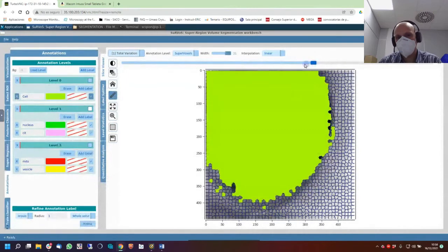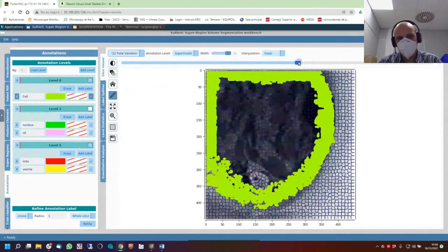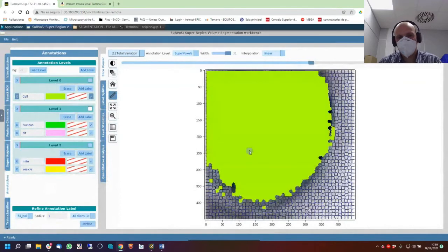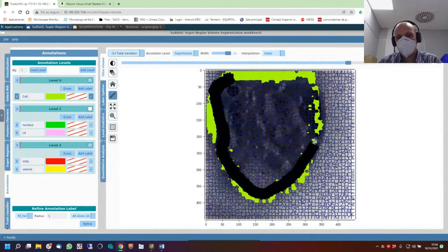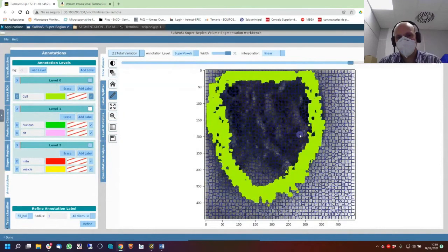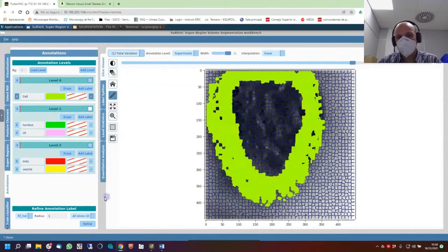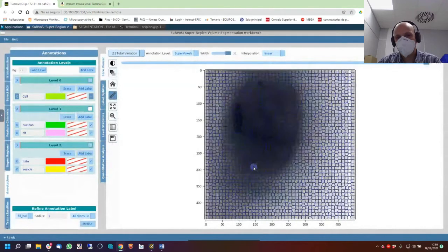Hey, there is some here. Why is it open in some way? Or again, fill holes, 2D, refine. Yeah. Again, this one is open. Again, now it's open because it's standard in 3D, the one I print, so refine. But once you are happy, up and done.